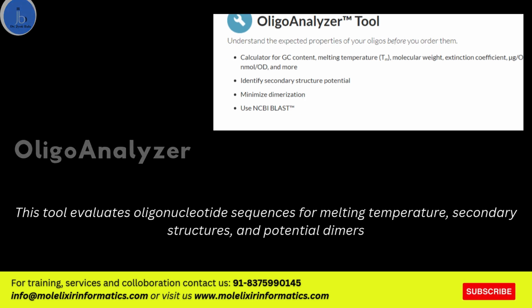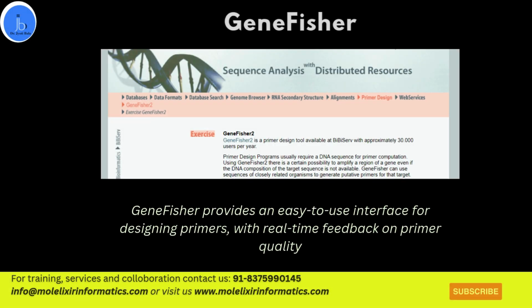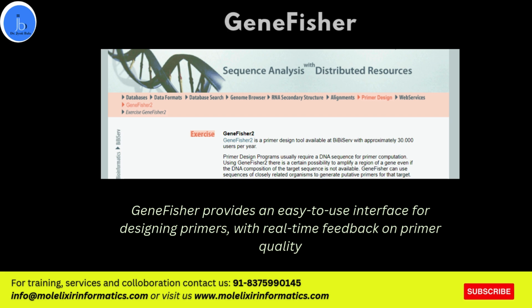The next tool is GeneFisher. It is an interactive PCR primer design tool. GeneFisher provides an easy-to-use interface for designing primers with real-time feedback on primer quality. It supports batch processing and includes algorithms to avoid primer-dimer formation.